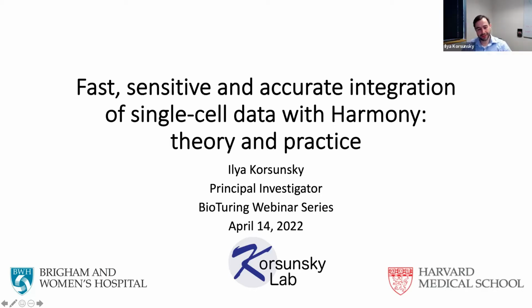The title of today's talk is the title of the manuscript. I added 2 words to it, theory and practice. This is where I really like to communicate with the community to make a leap between the math behind the model, which I think is relatively simple, and how that connects to data analysis and practice.